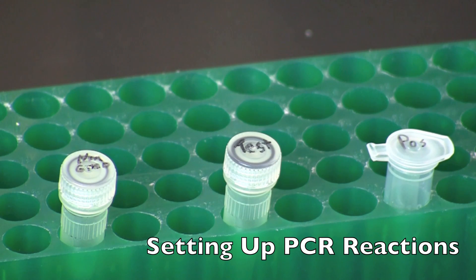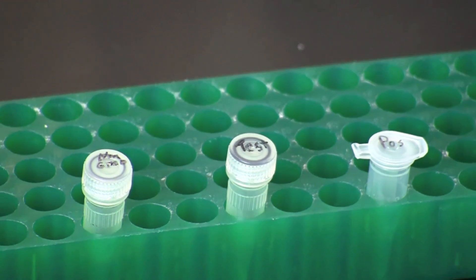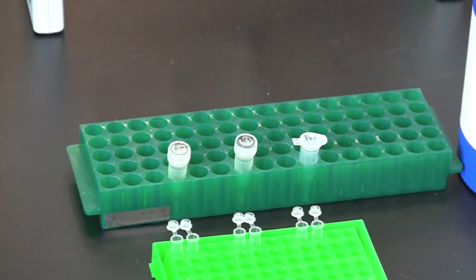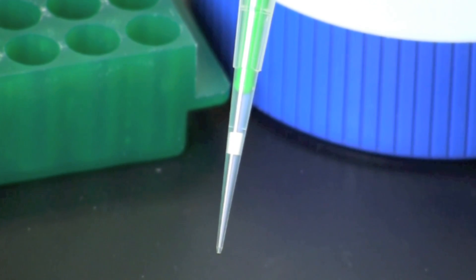To set up your PCR reactions, you will need your tubes with extracted DNA template from non-GM food and your test sample. You will also need a GMO-positive controlled DNA and 6 PCR tubes. Set your micropipette to 20 microliters. Always use aerosol barrier tips when setting up PCR reactions to prevent transferring aerosols from the pipette to the sample.